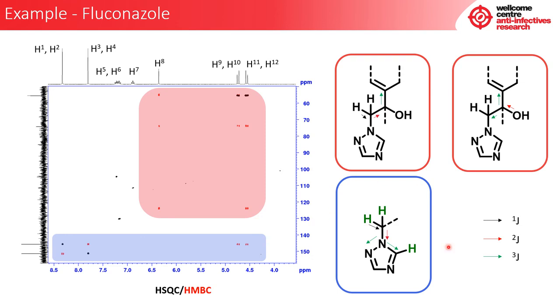So what do we want to now say? Okay, we have 2 sets of quaternary carbons here, and it is shared by the CH2s as well as this potential heteroatom. So how does that actually look? Here, we have an aromatic carbon because it falls within the aromatic region. So looking at the structure of fluconazole and counting for, let's say, the CH2 at least, let's count the bonds. 1, 2, and 3 to be able to reach this quaternary carbon, and I've indicated it as being in green.